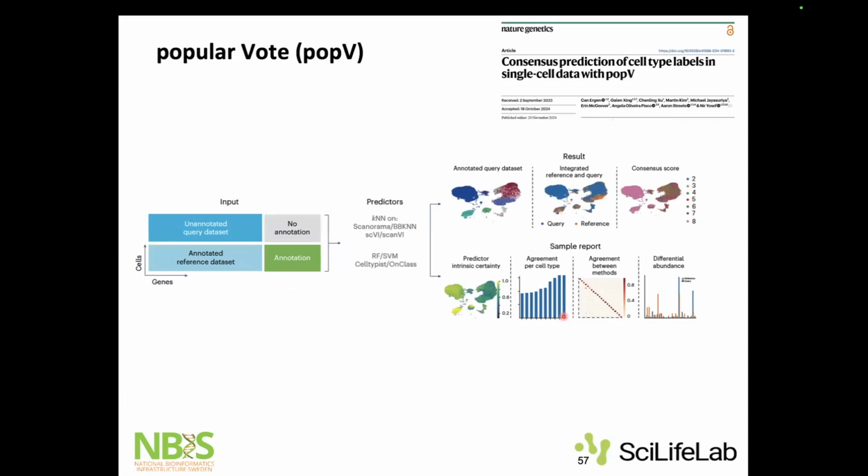There have been some efforts to tackle this issue, so that we can still do automatic annotation and get the best performance out of it. So we want to get the rejection as well, so we don't want to be only dependent on one specific method here.